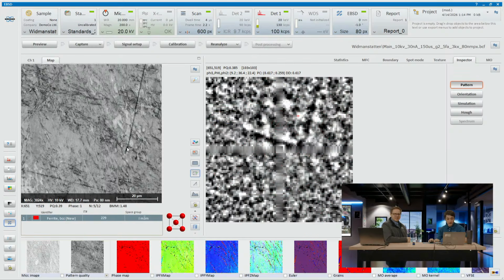We can see that this is... We don't really see as many Kikuchi bands in this case. So we're reading n equals 5 out of 12 here. And this is an indication that I'm looking at an area of my sample which is not diffracting, or not a diffracting crystal kind of thing.